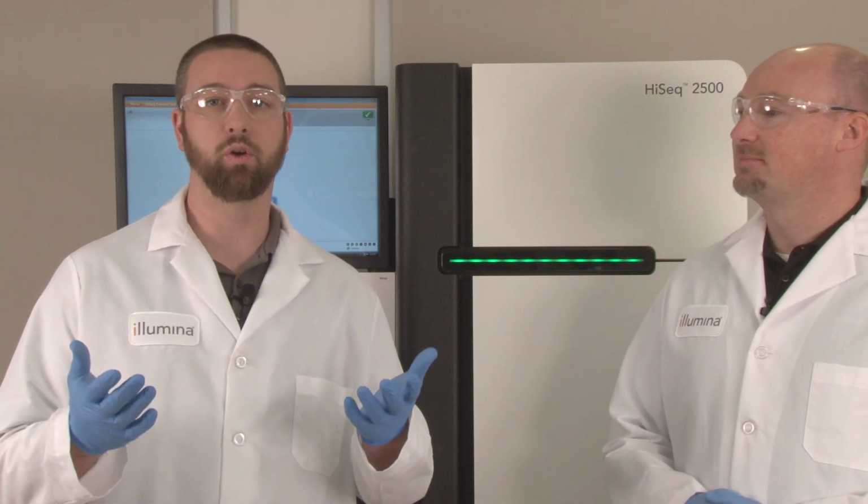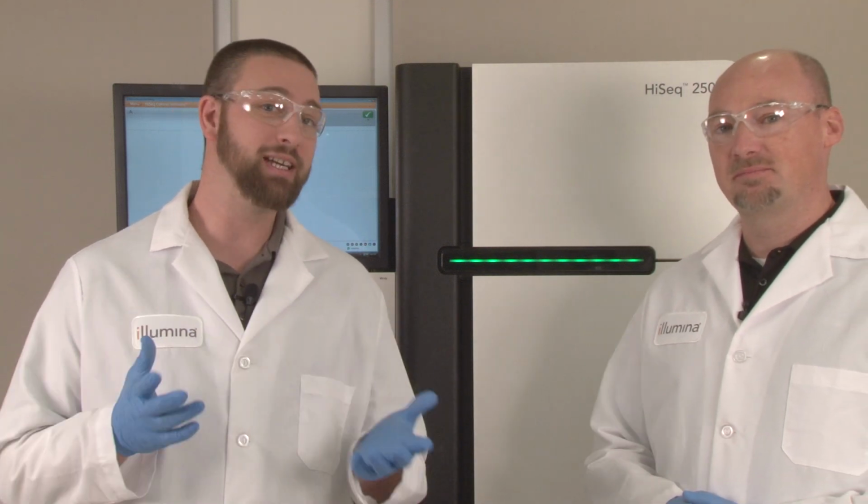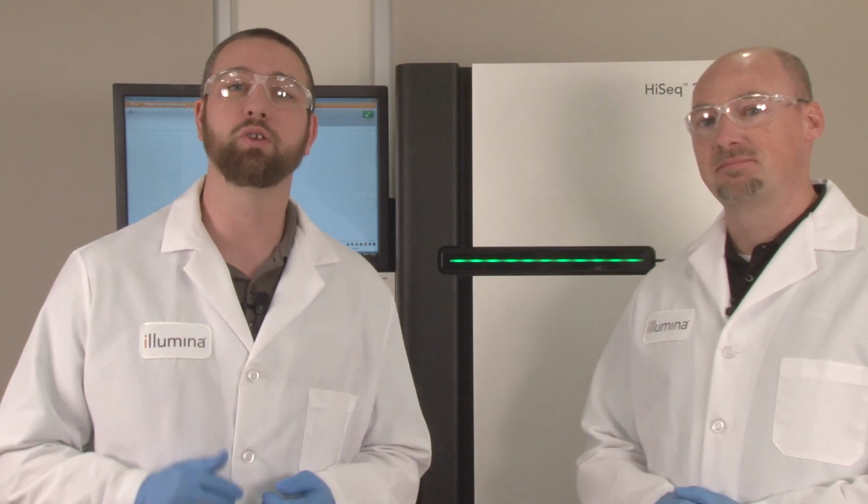This concludes the HiSeq Expert Video Tips series. Over the course of the 5-part series, we have covered numerous tips, troubleshooting advice, and best practices for running your HiSeq instrument. We hope by showing common tasks related to the computer, fluidics, thermal, and mechanical systems, as well as maintenance best practices, we have enabled you to drive your research forward by utilizing the HiSeq to its optimal capacity.